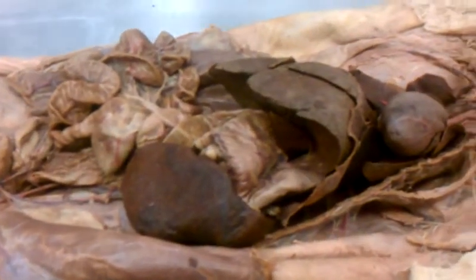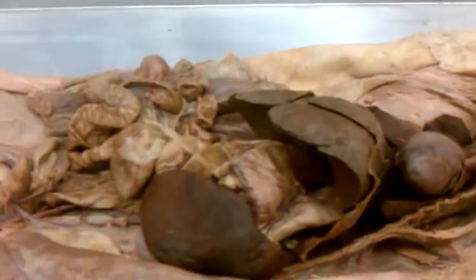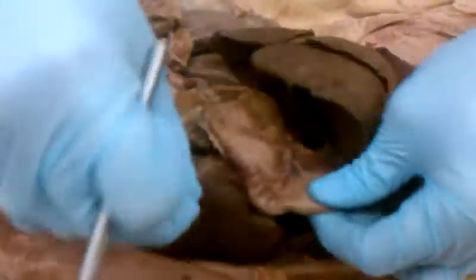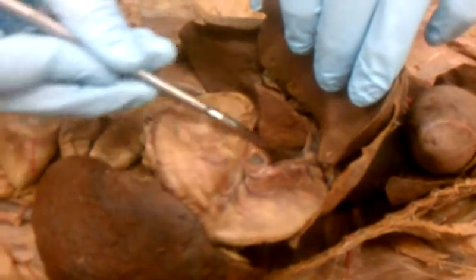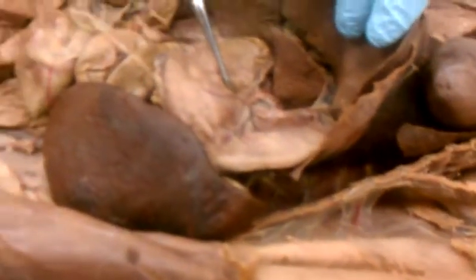And then you have the gastric glands. Where do you think the gastric glands and your gastric juices are? Your stomach. So they're glands inside of the stomach, which is this thing right here. That's the stomach. So the gastric glands are in here.